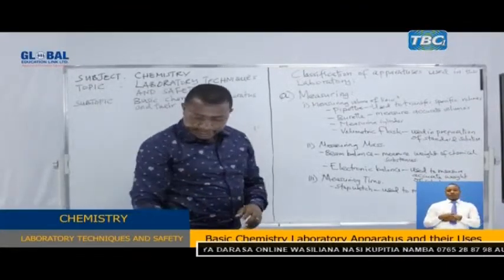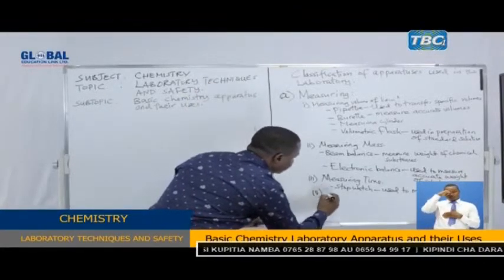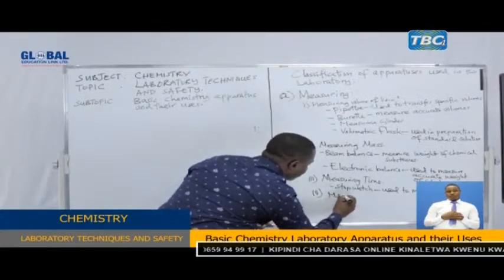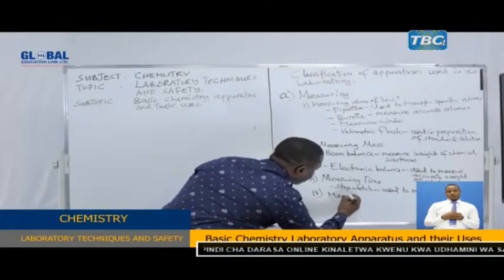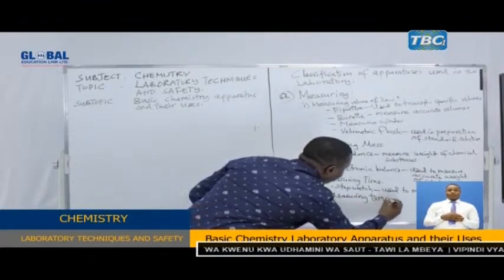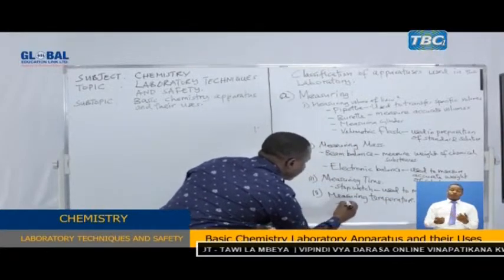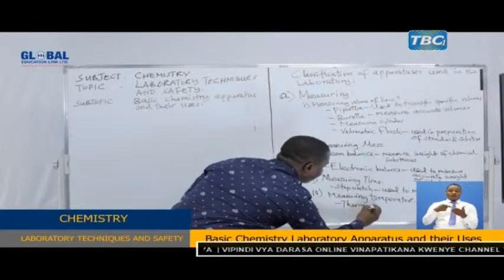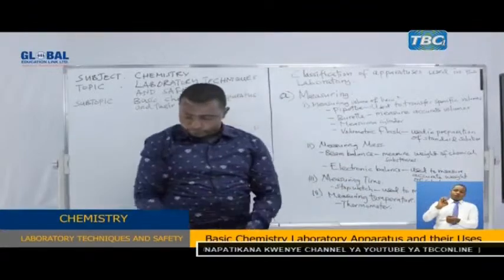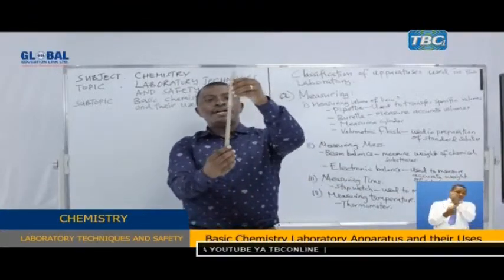We also have another apparatus for measuring temperature. The apparatus is known as a thermometer. You can see it here, it is in its case.